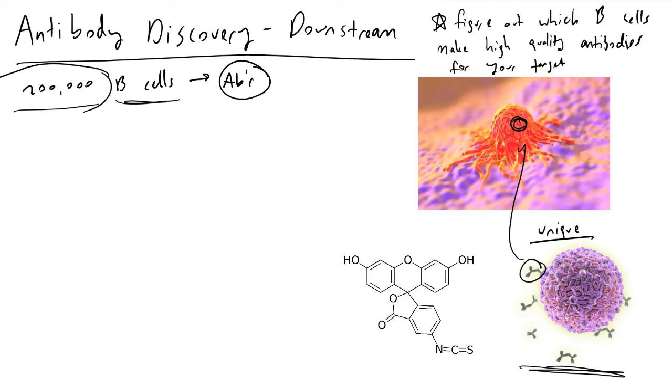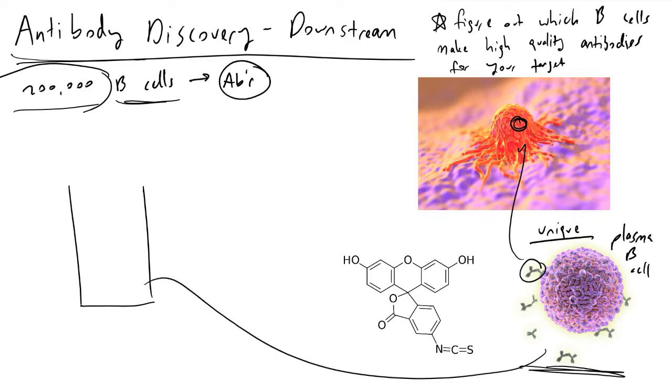So what I'm going to say is there's a company called Berkeley Lights, and they have something called the Beacon and a new product called the Lightning. Specifically on the Beacon, we can use this for antibody discovery, in which we're going to be having individual B cells inside of pens. So this plasma B cell that I have, the purple thing here, will be loaded into a pen. It's going to be secreting antibodies that are going to be drifting away from it outwards.